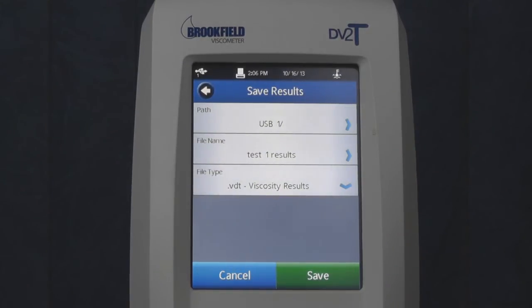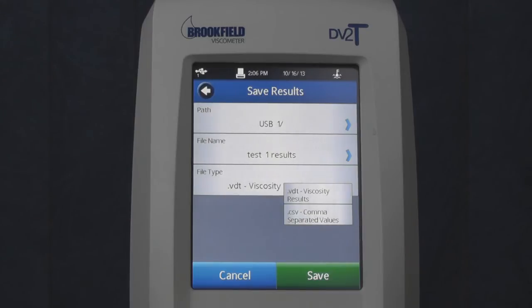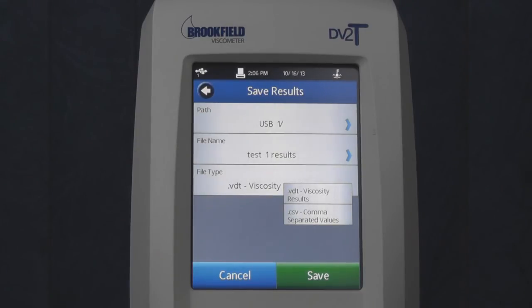Review your path, file name, and file type. Note that there are two types of file formats: VDT, the native format for viewing data with a touch instrument, and CSV for exporting data in Excel format. Save data in CSV cannot be converted back to VDT.